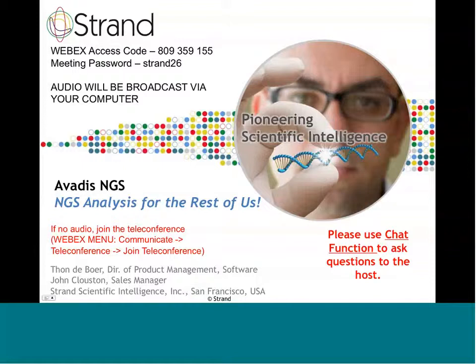And the goal of the seminar is to provide you with enough information about each of the three main NGS workflows so that it's easier for you to decide to investigate the software further. And we'll take you through the three workflows and also take you into the biological context.